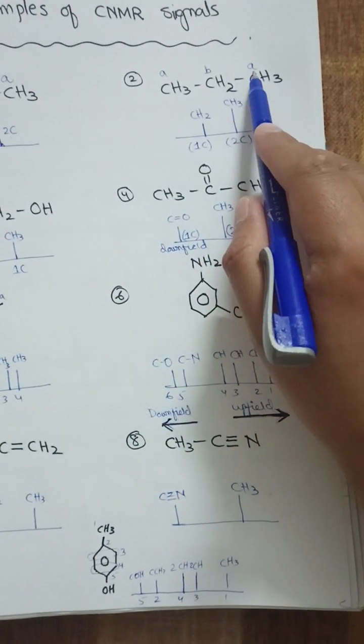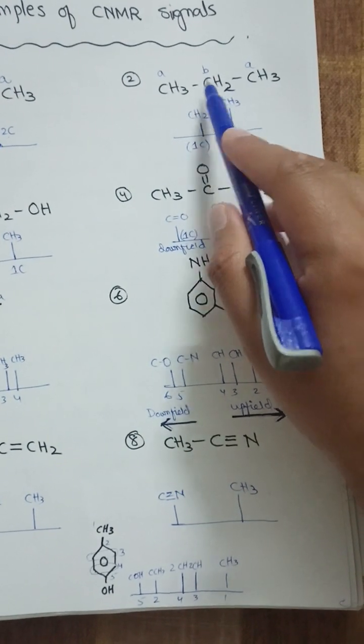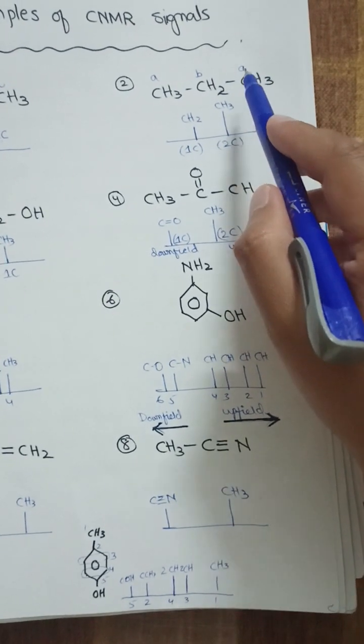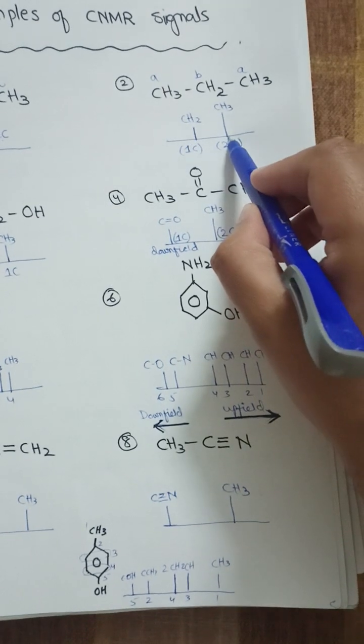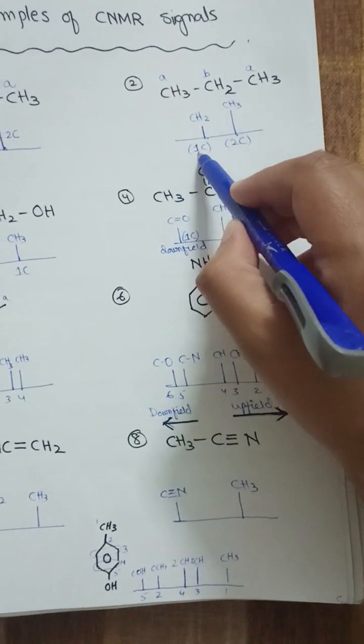If we consider propane, the terminal carbons are the same, which is represented with A, while the internal carbon is B, which has a different environment as compared to these two. So we will get two signals, CH3 at the upfield, whereas CH2 at the downfield for one carbon.